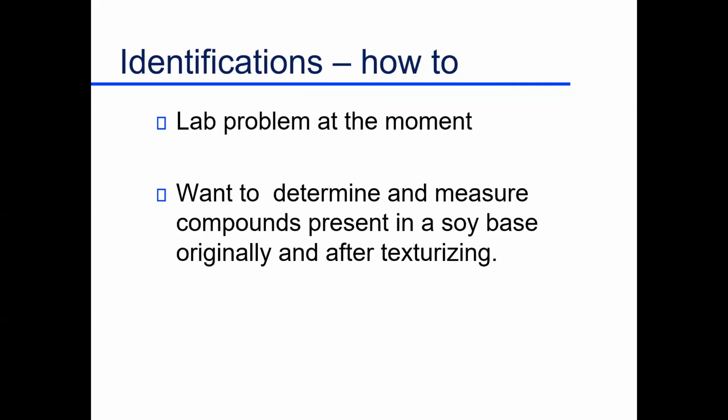analytical problems. And kind of what I mentioned about the problem right now, looking at volatile compounds, identifying them and quantifying them in plant proteins or any other product, I don't care. Maybe you're working on meat, what flavor compounds are in meat. Okay, good. So this technique is extremely valuable for that. And this particular problem that I'm giving you an example of comes from one of your colleagues. So Chrissy is doing a project down in food science, a grad student there.